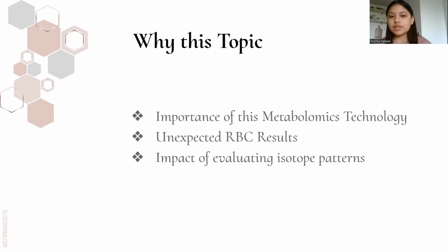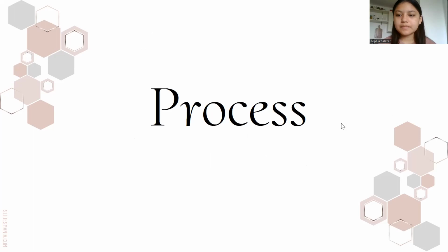Another reason why I chose this topic is because isotope tracing does have a greater impact in medicine, as metabolites can be identified and studied to be linked to human diseases, cancer, and diabetes. So it's really interesting to see how subjects like biology really do link and have a greater impact on the pursuit of medicine. So now I will speak on the process or methodology to extract all of my data.